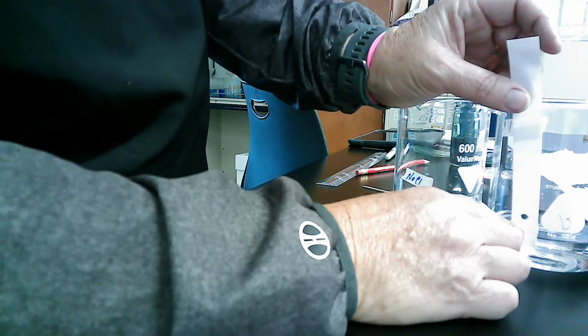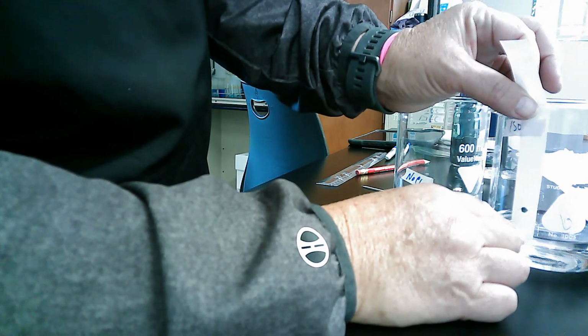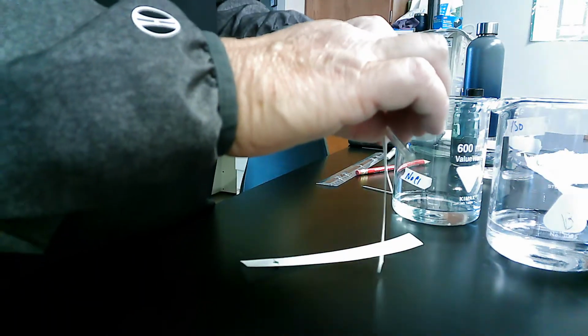So I'm going to say, okay, if I want it to be about that high, I know that I need about this much of it to hang down. So that will put it in my solution. Now I'm not going to hang it on the side. I'm going to hang it over a stirring rod just to help keep it in place.